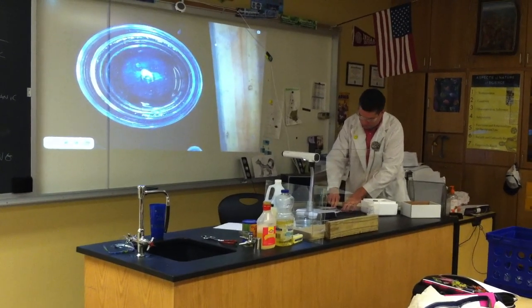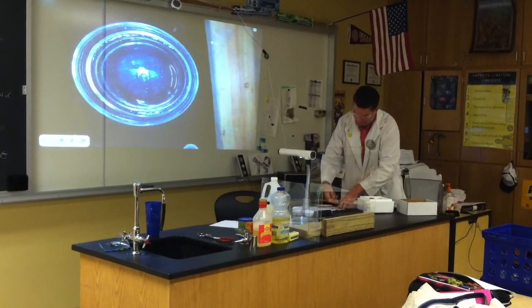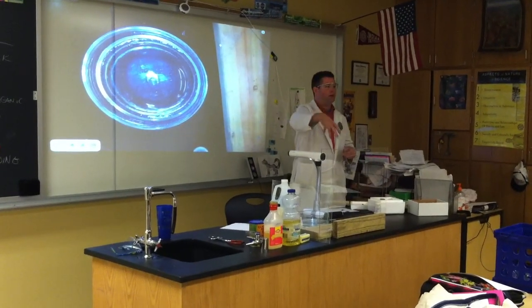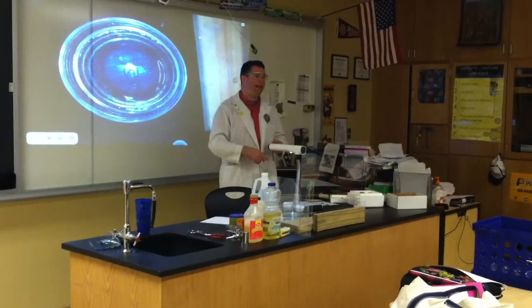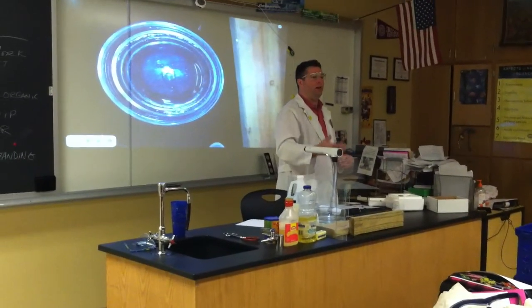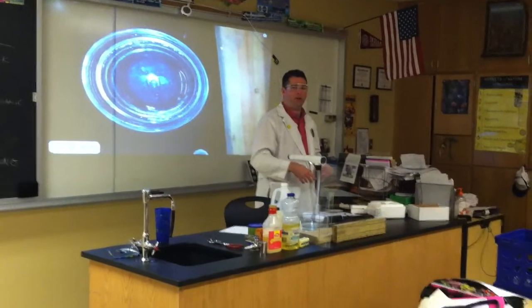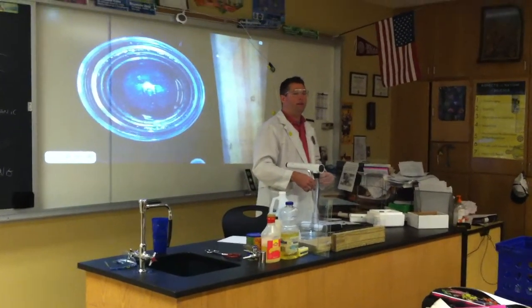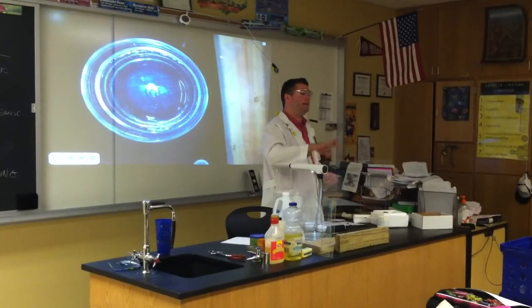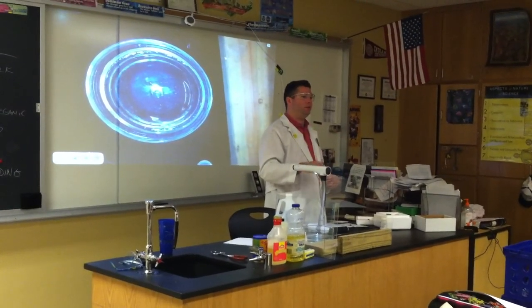I'm going to start off with a pretty small piece. All right, and you guys can see what happens. What's going to happen is it's going to react with the water. It's going to give off hydrogen gas. Have you guys ever heard of hydrogen gas? Yeah. All right. Where have you heard of hydrogen gas? Gas station. All right. Maybe at a gas station they're talking about hydrogen fuel cells.